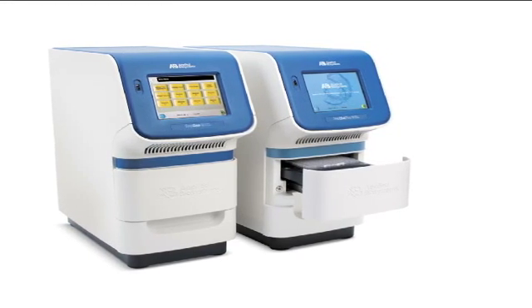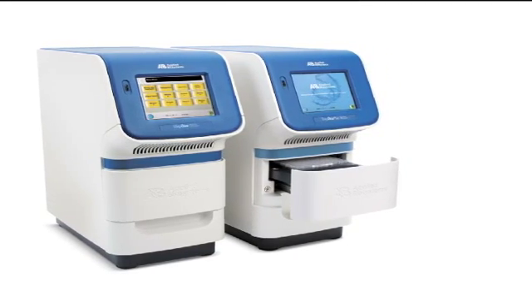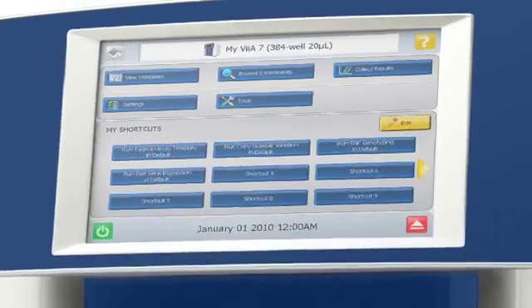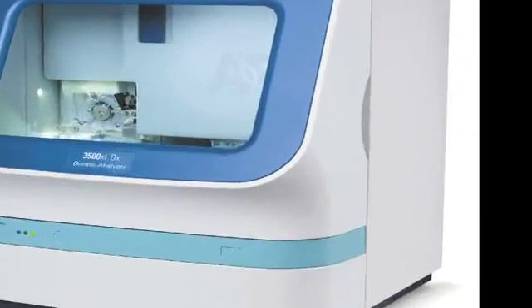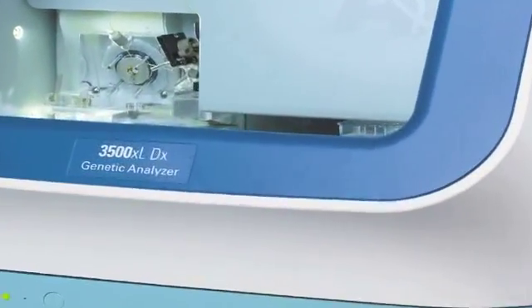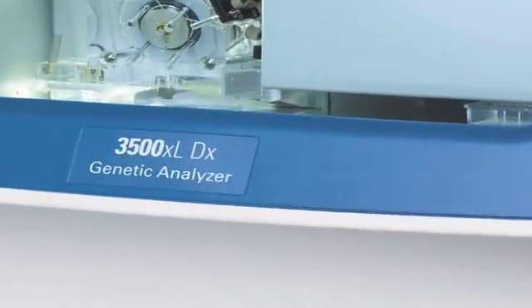It's no surprise that these reagents and devices are now recommended by leading journals and institutions as the best for quantifying RNA or DNA in applications like QPCR, RT-PCR, and sequencing.